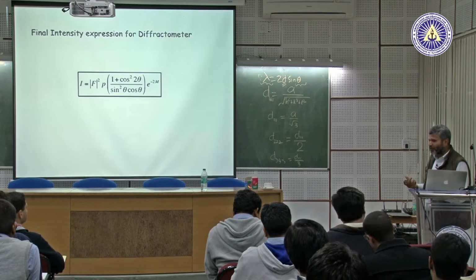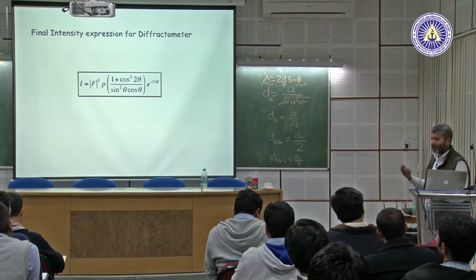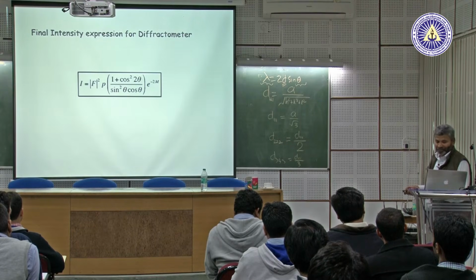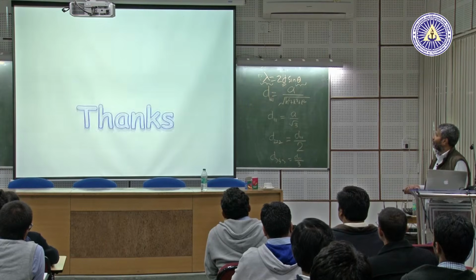Cullity also has not gone into much detail about this. So, if you really want to look up the temperature factor in detail, the Debye-Waller factor and all, you will have to go to more advanced books. So, this will be the final intensity expression.